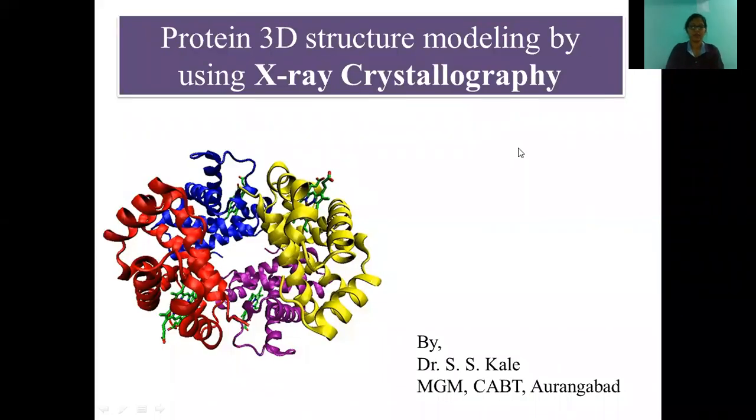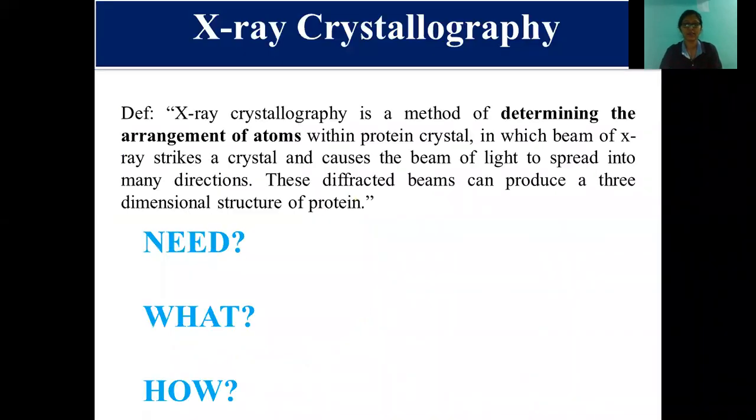Hello everyone. Today's topic of my tutorial is protein 3D structure modeling by using X-ray crystallography. In the previous tutorial, I already explained homology modeling, which is one of the in silico techniques also used to predict the 3D structure of the protein. In this tutorial, today we will see about X-ray crystallography.